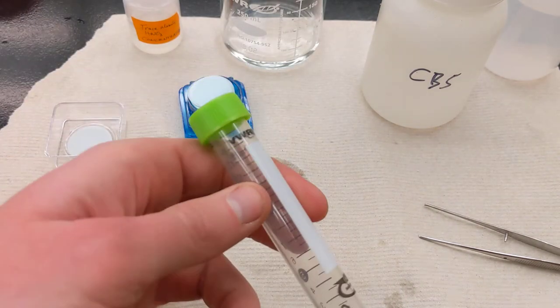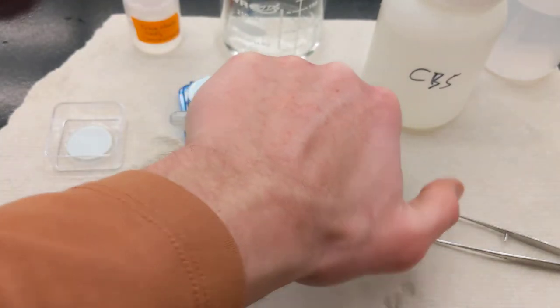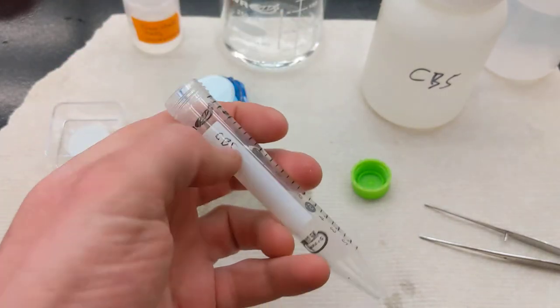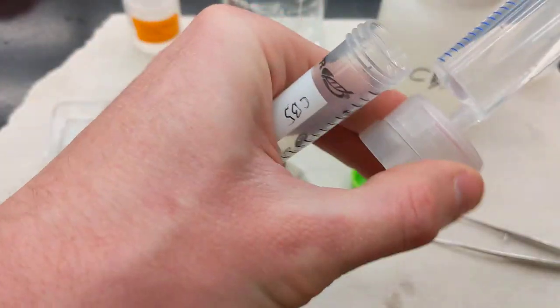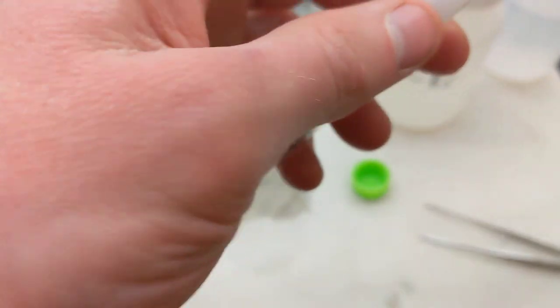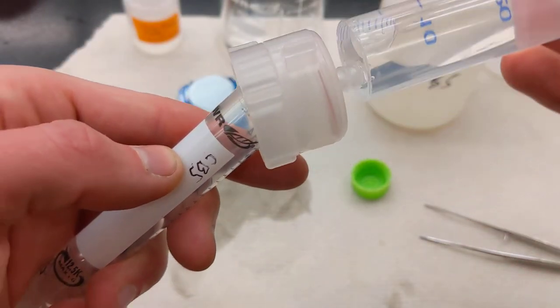I'll take my 15 milliliter falcon tube, undo this cap. Again, be careful you don't contaminate this. Make sure you've labeled this. Attach your filter here, and then make sure you put the spout of the filter directly in the center.